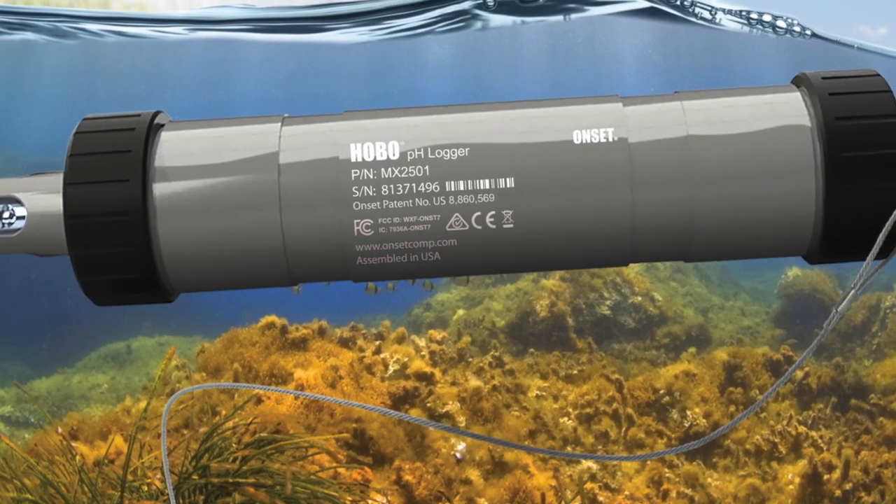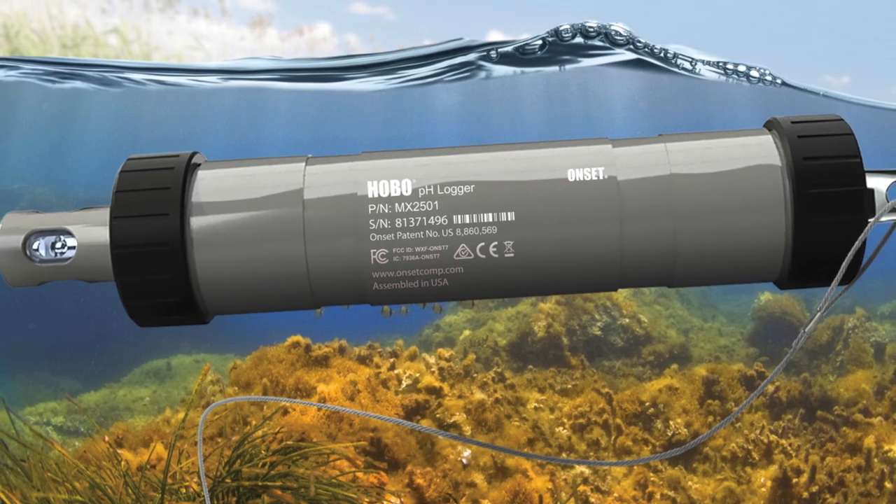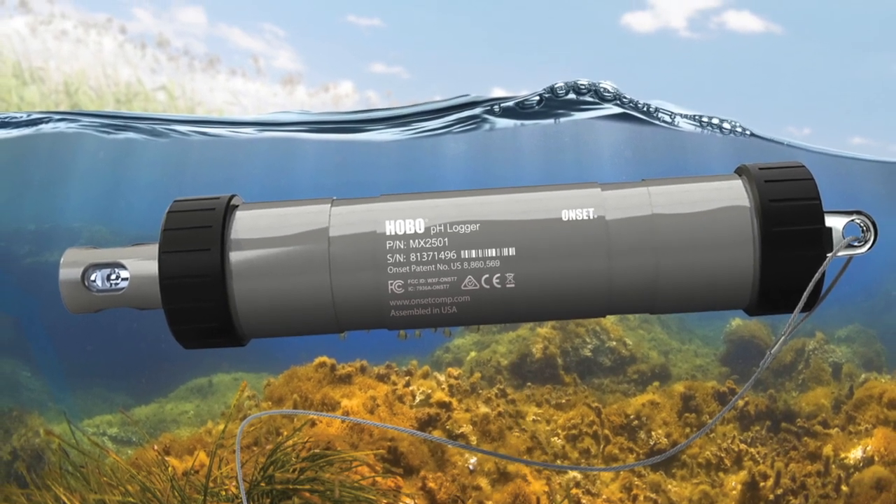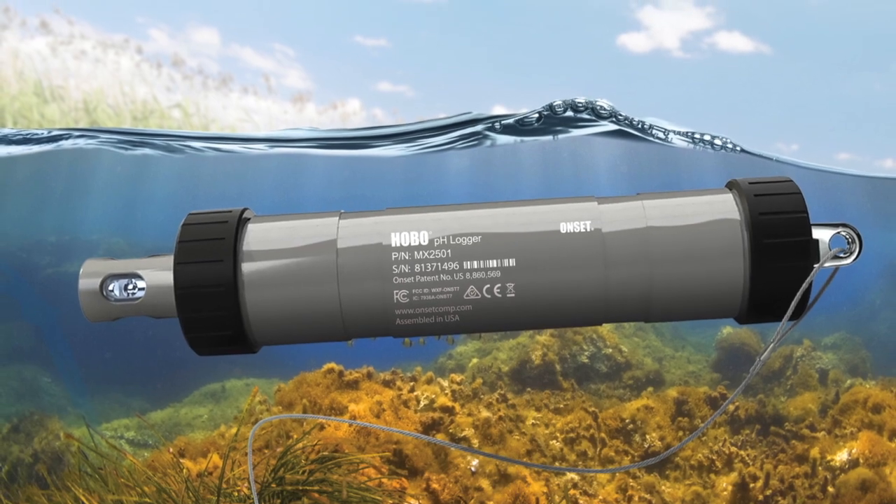The MX2501 logger delivers high accuracy of plus or minus 0.10 pH units within plus or minus 10 degrees Celsius of temperature at calibration, and can be deployed in water depths of up to 40 meters.